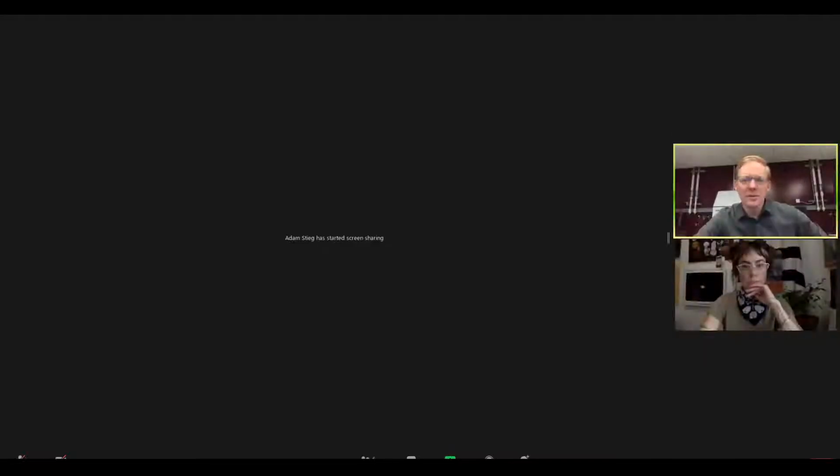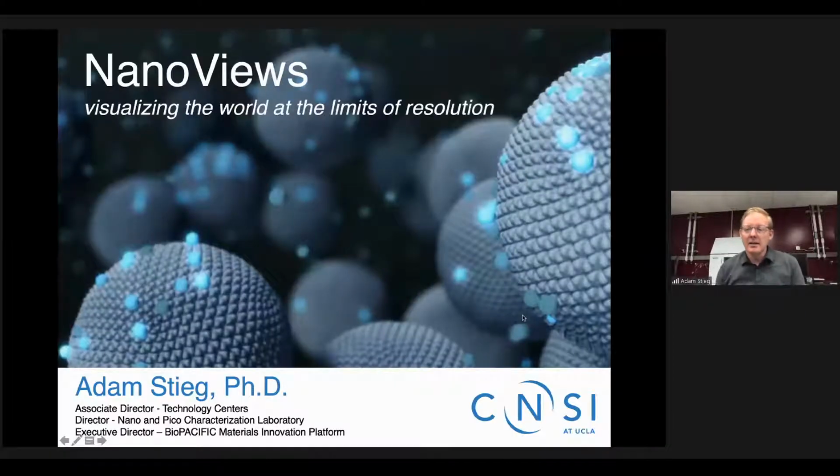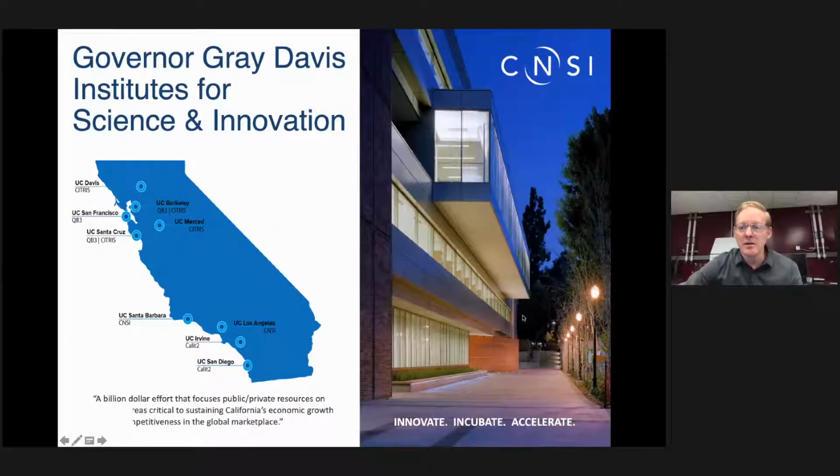So to get the ball rolling on this, I'm just going to switch over here and go into a short slide deck. And hopefully you can see me and see the screen at the same time. I'm basically just going to be talking about how it is that we use advanced technology to visualize the world around us. It's the limits of resolution, pushing it down to the smallest of scales, because it's really important that we understand what it is we're measuring, what it is we're working with when we're doing nanoscience and technology. So, as Caitlin mentioned, I'm at the California NanoSystems Institute at UCLA.